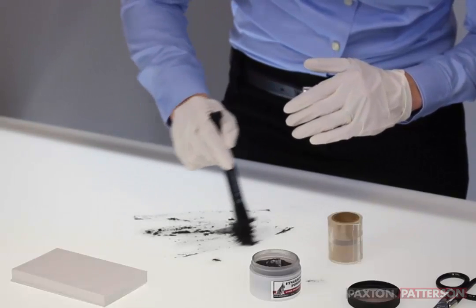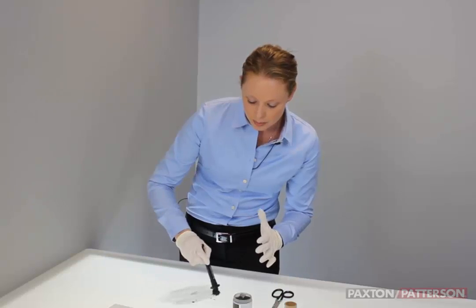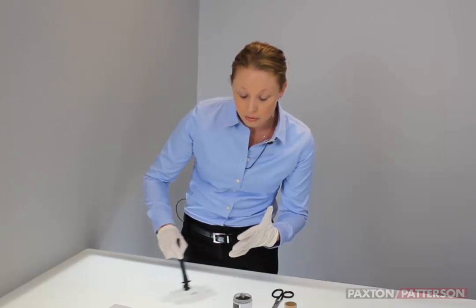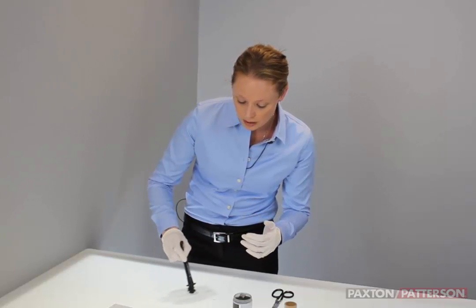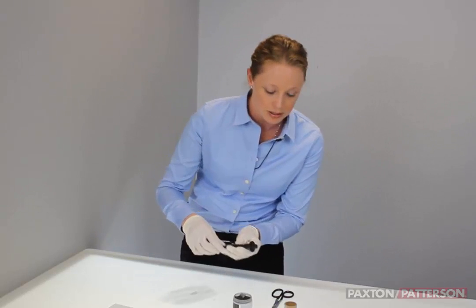We're going to clean this up a little bit before we actually collect it. Interestingly, fingerprints are made up of three things: sweat, oil, and protein. It's the oil in your fingerprints that the magnetic fibers are actually clinging to.